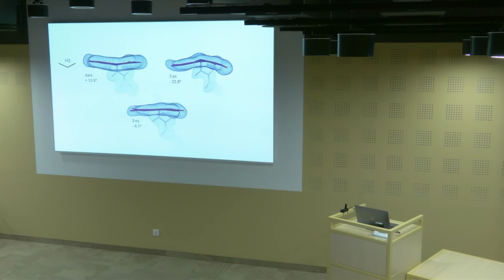So in some ways still a lot of sp3 character around the central axis, but now pointing down at 3 picosecond pump-probe delay, where we know that the flavin must be in the excited state at this point. And what we can see is that those residues surrounding the flavin site are able to move in order to accommodate this structural change.